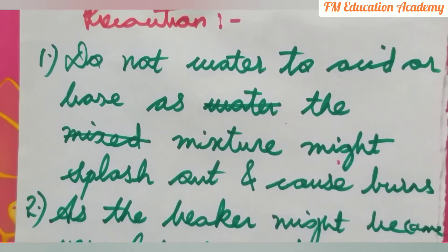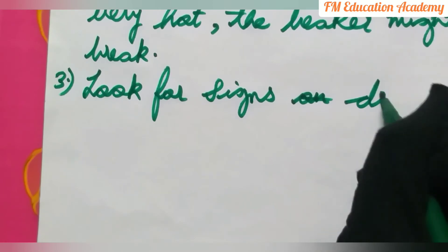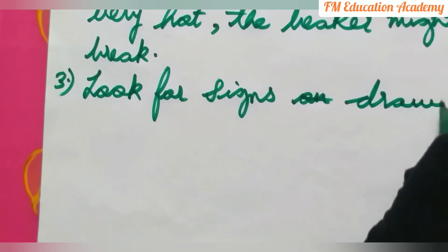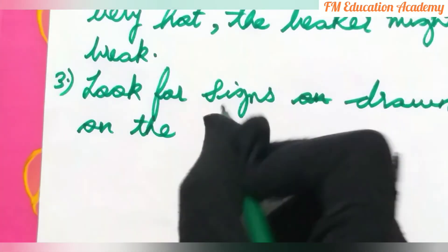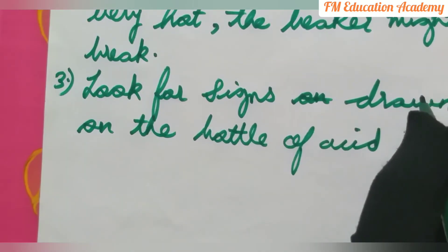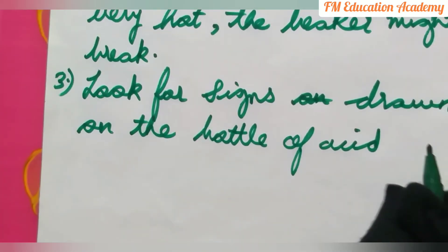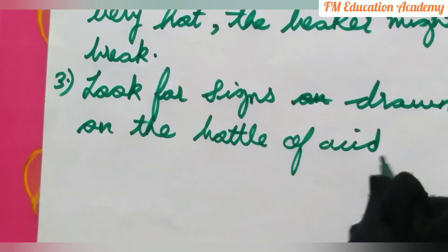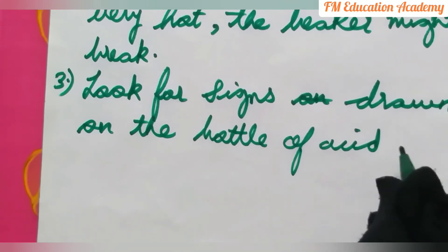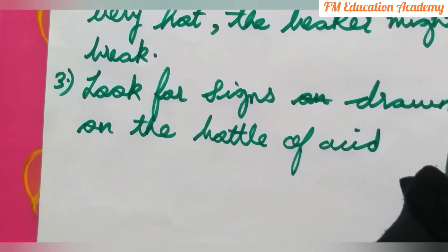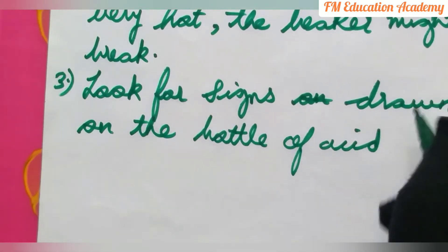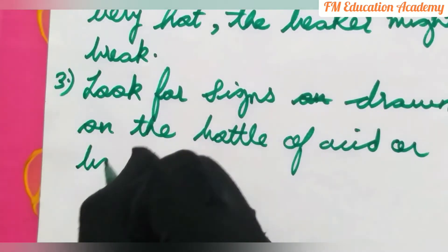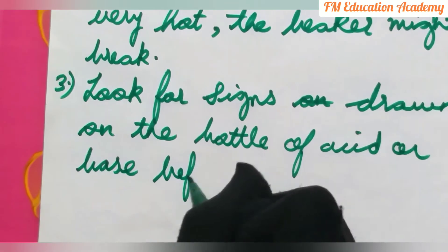Also, look for warning signs drawn on the bottle of acid or base before using them. For example, concentrated sulfuric acid, concentrated sodium hydroxide, and concentrated nitric acid all have warning signs on their bottles. Always check these signs before use.